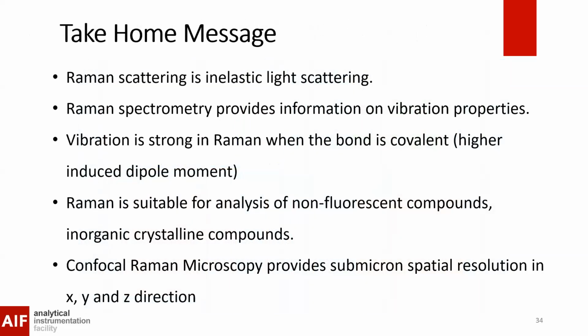Okay, so the take-home message of my talk today is, by the end of the talk, I hope you understand that Raman scattering is an inelastic light scattering, and Raman spectrometry provides information on the vibration properties of the materials or the bond. And the vibration is strong in Raman when the bond is covalent, because of the higher induced dipole moment.